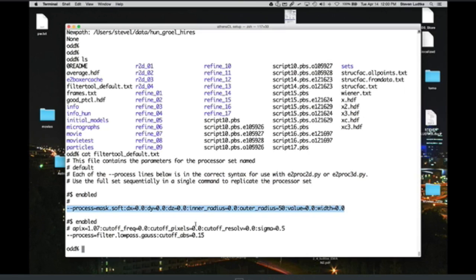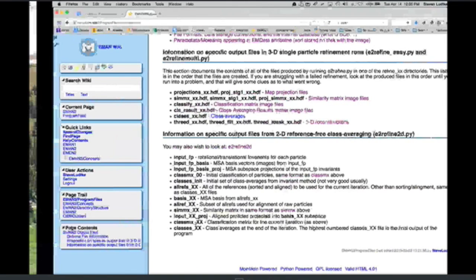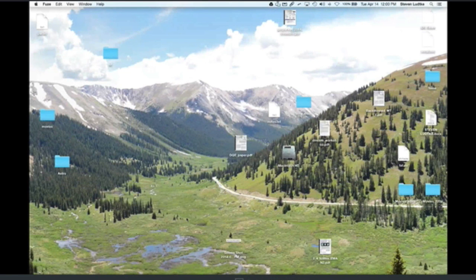Okay, we've gone for an hour now, so I think I'll go ahead and stop with the presentation at this point. If anyone has any last questions out loud or otherwise, please feel free to ask them. Otherwise, we'll just sort of wrap it up. If you want more information, I encourage you to go to the wiki, work your way through one of the tutorials, and it'll teach you a lot of the features of the system.